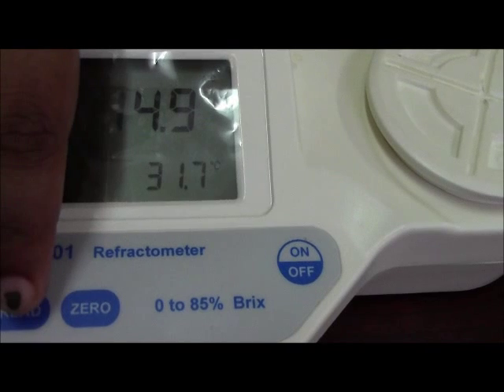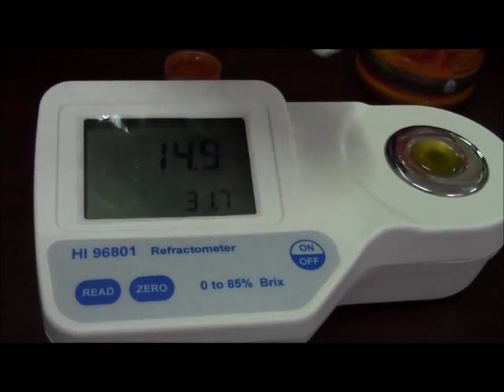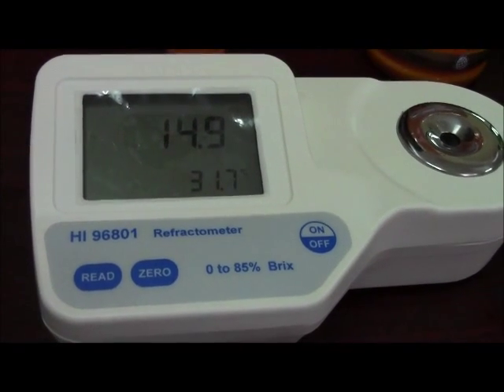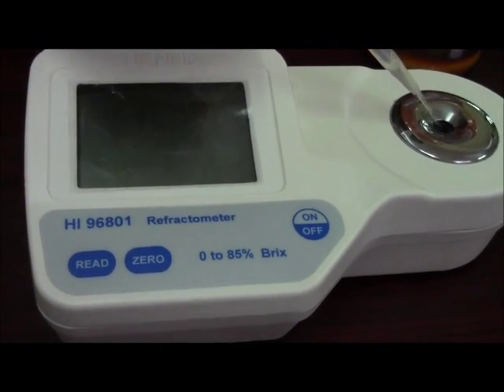It is showing 14.9 for your Slice sample. Rinse off the sample and clean it with distilled water.